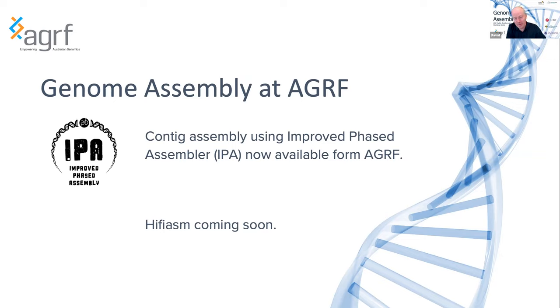Of course, for those of you wondering, we are looking at HiFiasm as well. As you've heard, it's a very good assembler and includes flexibility to include Hi-C or Omni-C data in your assemblies. That's something that's coming soon. So for some of you, we hope this will be an attractive option. Many of you, however, will want to get your own hands dirty with genome assembly yourself. Perhaps you want to tinker with some of the parameters, perhaps you want to try different assemblers. One of the options you might use if you're trying to get into doing genome assembly yourself is the Galaxy platform, which leads in nicely into Gareth's talk.